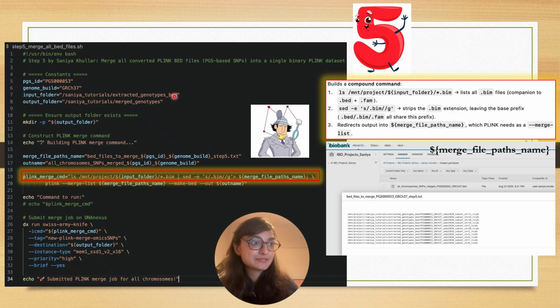What are the names? Then what it's going to do, in this part here after this pipe, this sed -e, is strip the .bim extension, leaving the base prefix. .bed, .bim, and .fam all share this prefix.